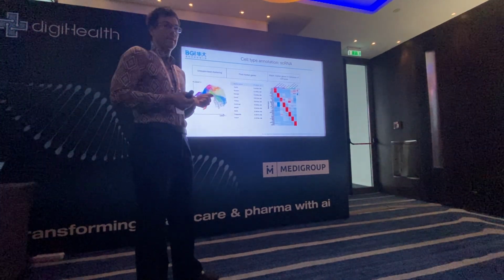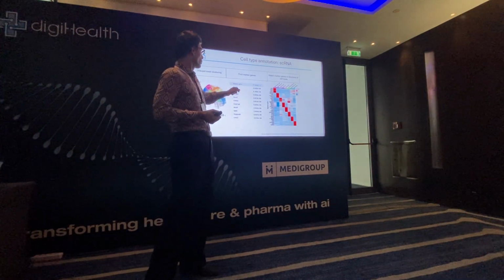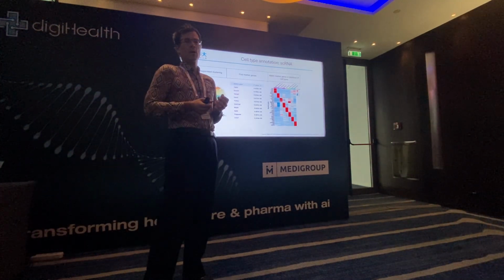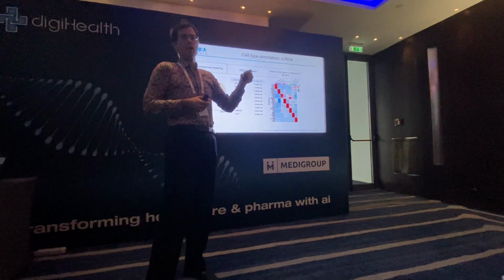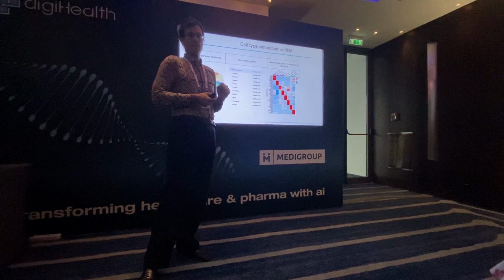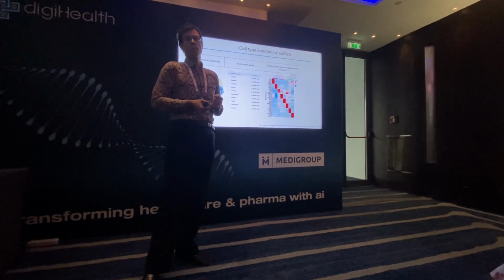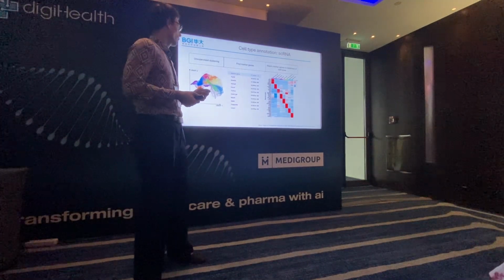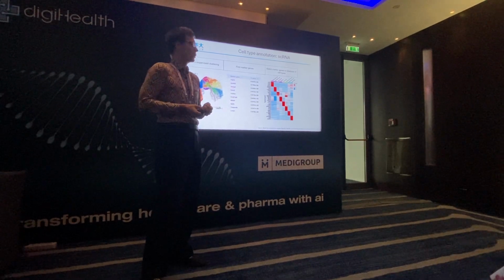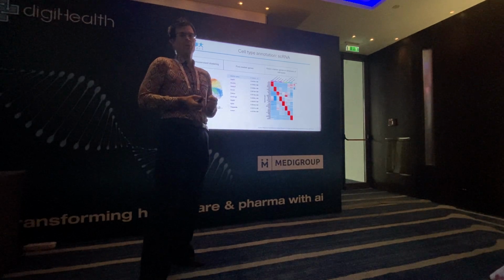And because of that limitation, because of this gene dropout, we are not able to reliably find these marker genes. Because this artificial dropout that was done during the sequencing process can give us false information about the variability. So the algorithms could be tricked when finding marker genes. Maybe they are not varying because of reality, because of the nature of the cell types that they belong to, but actually we didn't capture it correctly.